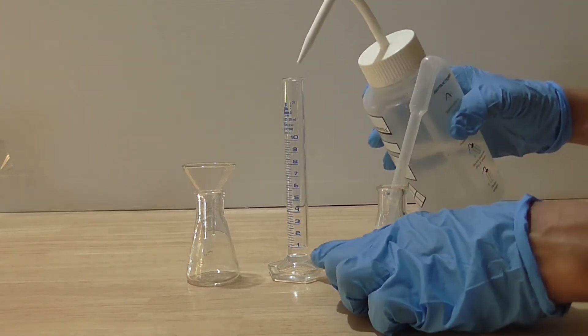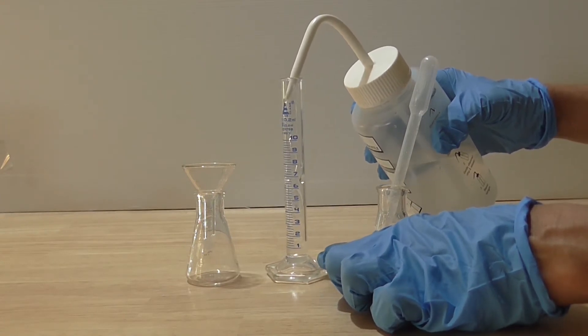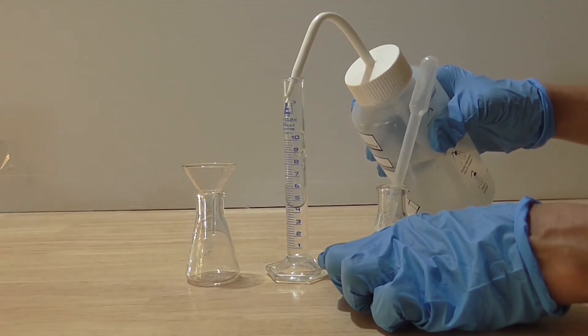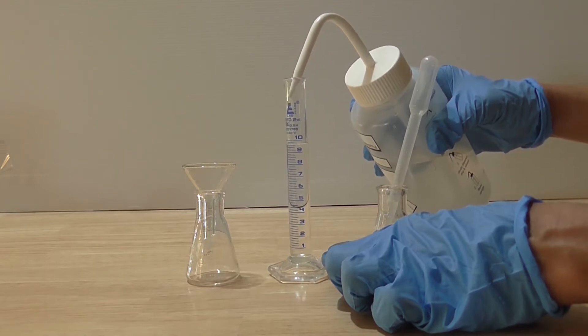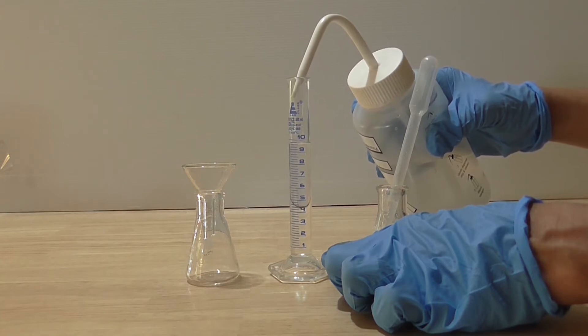I then squirt in 9 ml of water into the cylinder as well. The total volume of acid and water is now 10 ml. The dilution factor is 10. Therefore, my new acid concentration is 1 tenth of the 1 molar, making it 0.1 molar.